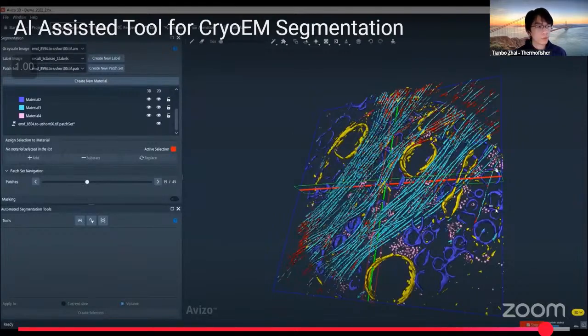deep learning opens up a new perspective, so that you can explore and grow your segmentation. Previously, it may just be incomplete, and then as you put in more information and build onto successful models, you are on the right track to eventually get a much more reasonable segmentation.